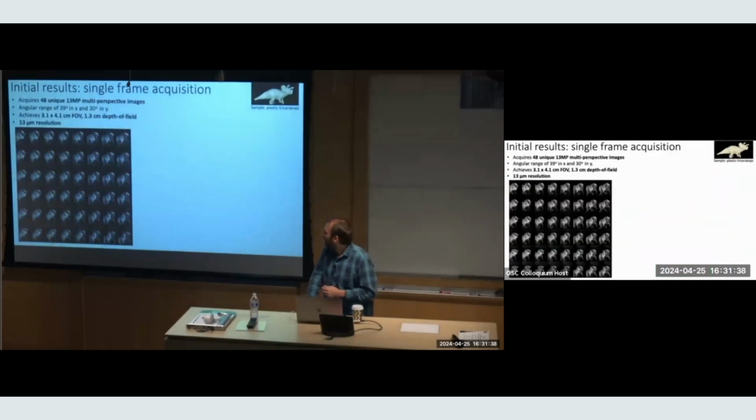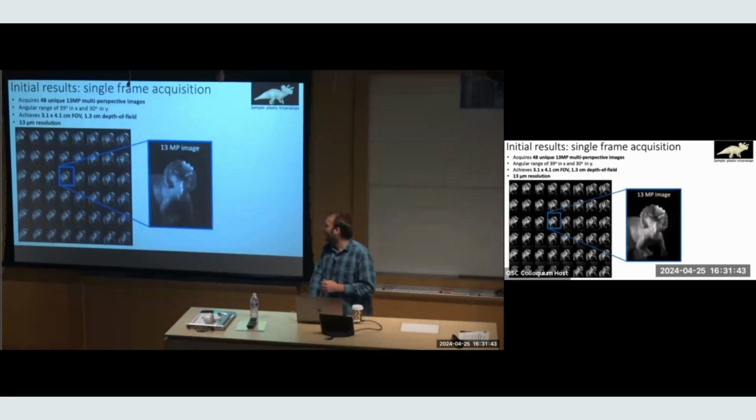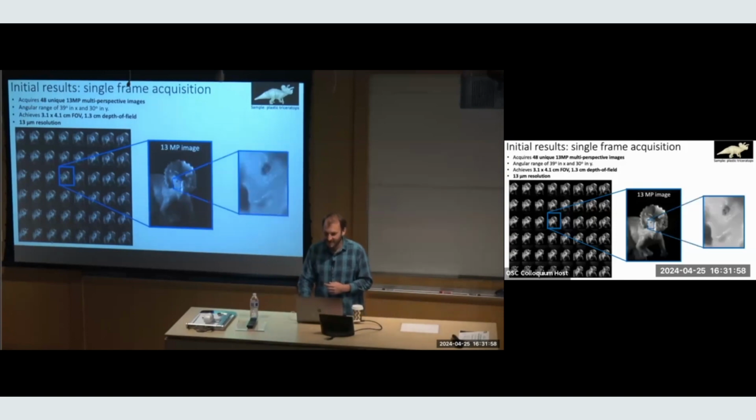Okay, and so we've put together the system, and here's an example of a dinosaur. And I didn't know this, but at a talk a few months ago, I saw Dr. Brady had a similar dinosaur for some of his cool 3D imaging work. So I was really happy that somehow the 3D imaging community, at least us, we've converged on dinosaurs as the metric of performance, plastic dinosaurs.